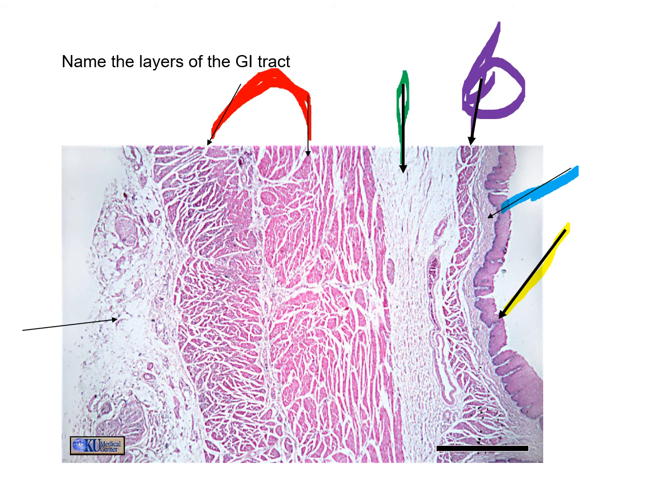Muscularis externa. Which one is this one? The circular. And then the second one? Longitudinal. Correct. And then the last arrow? Serosa or adventitia. Correct.